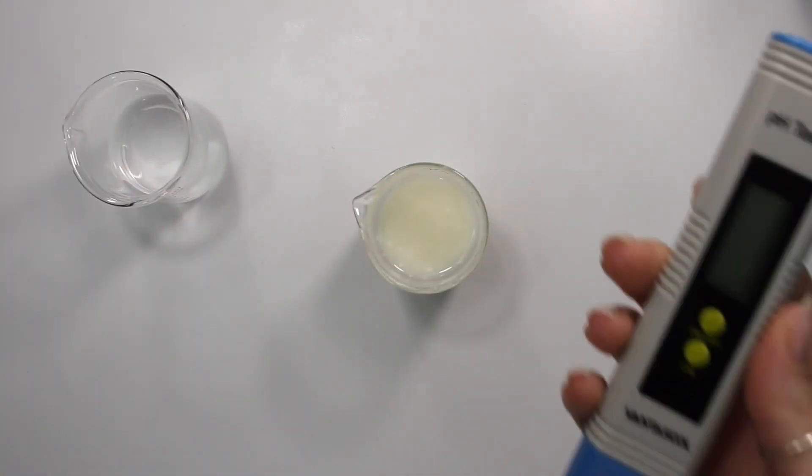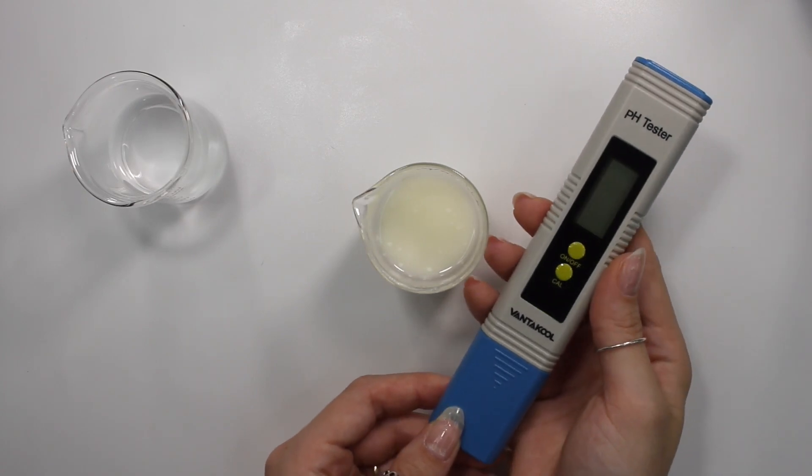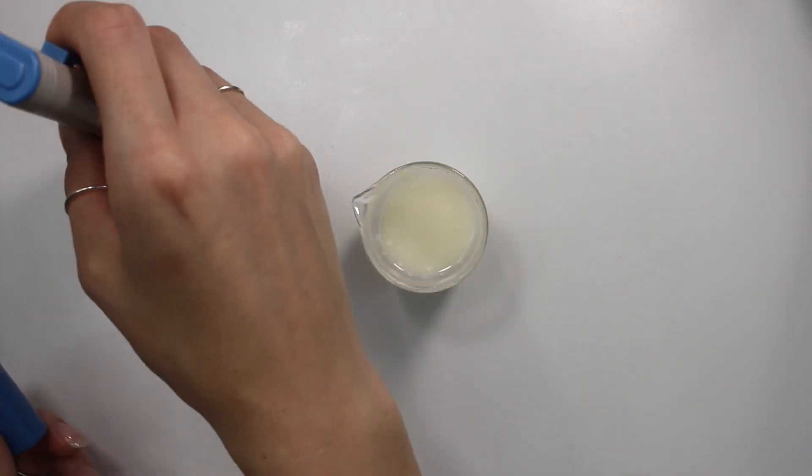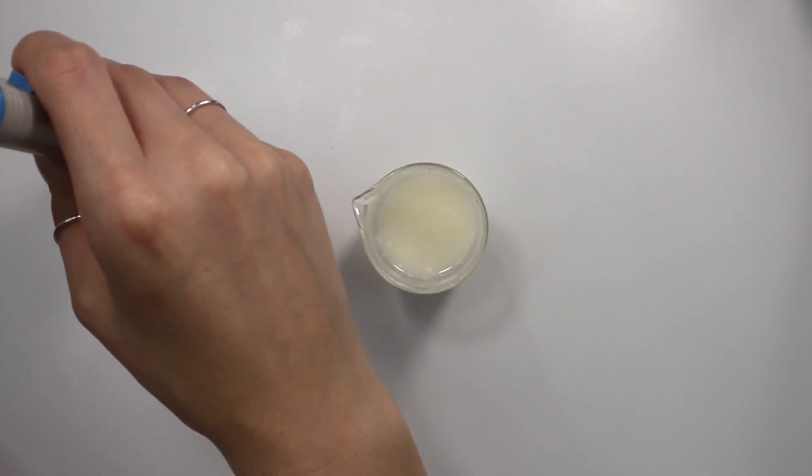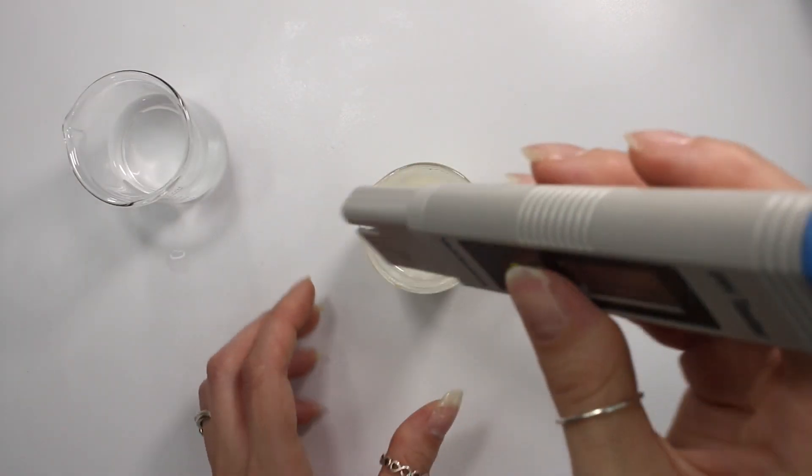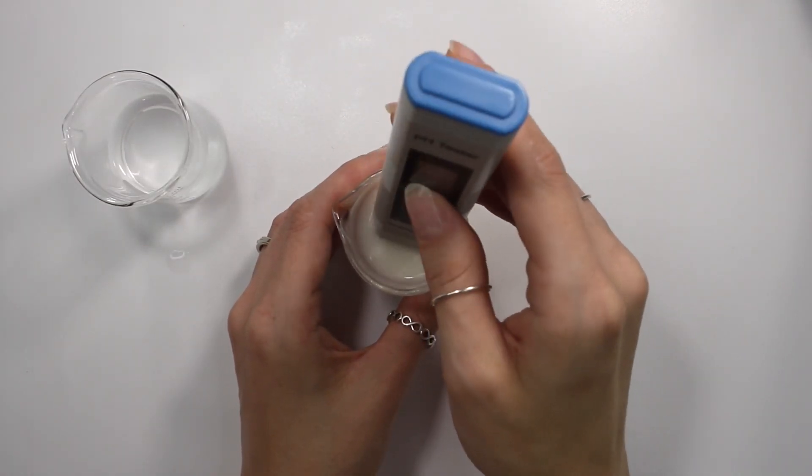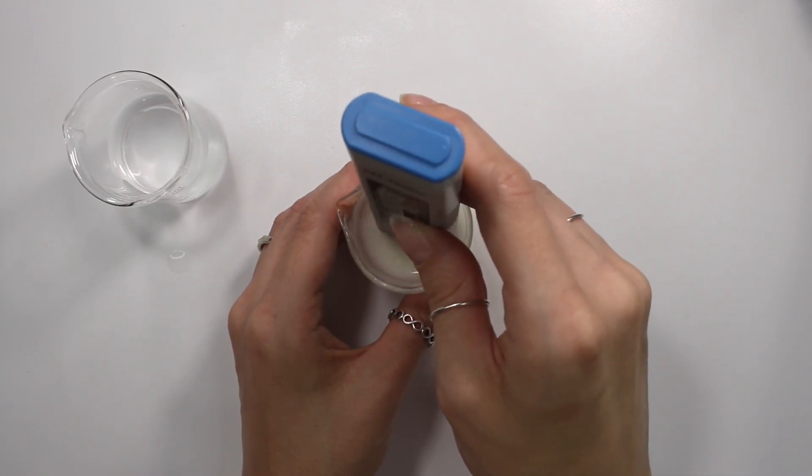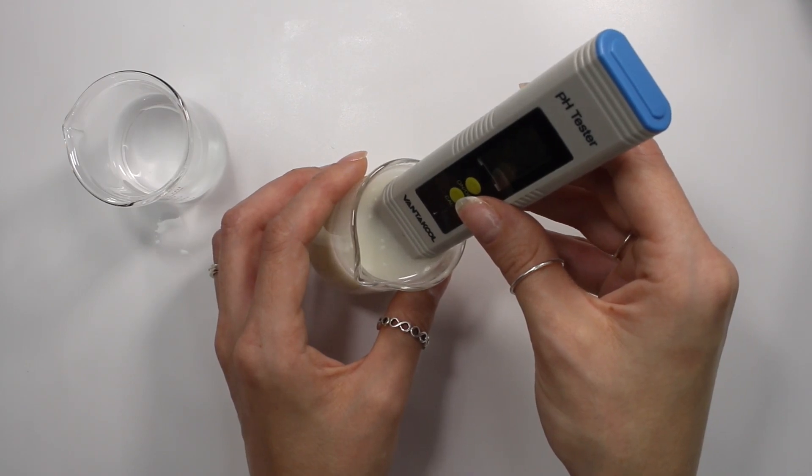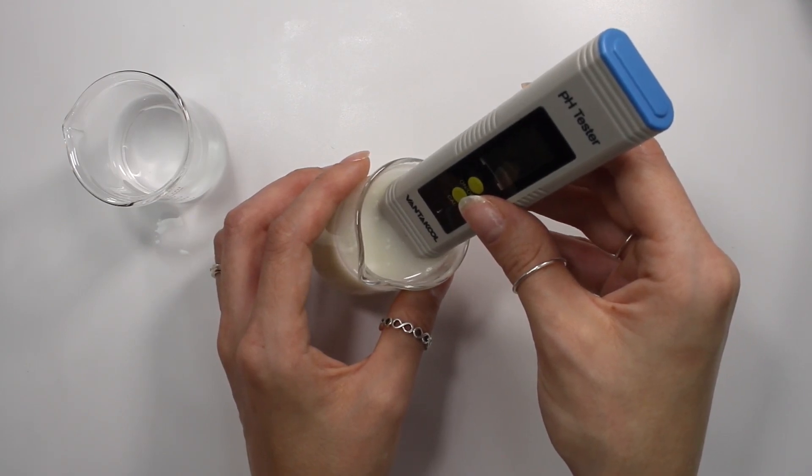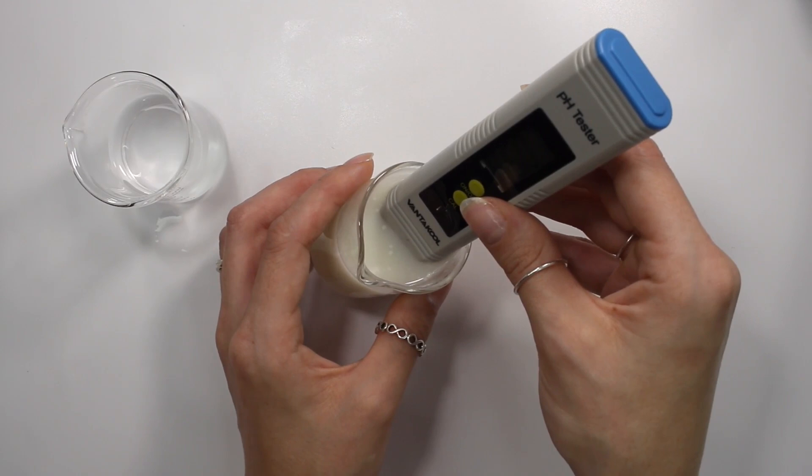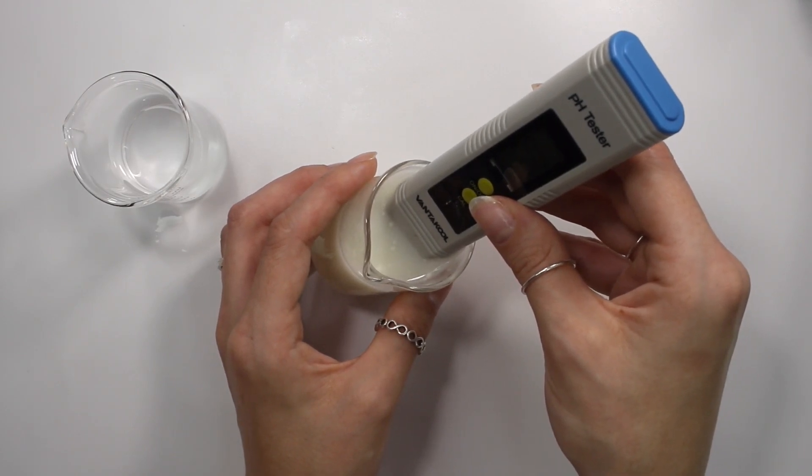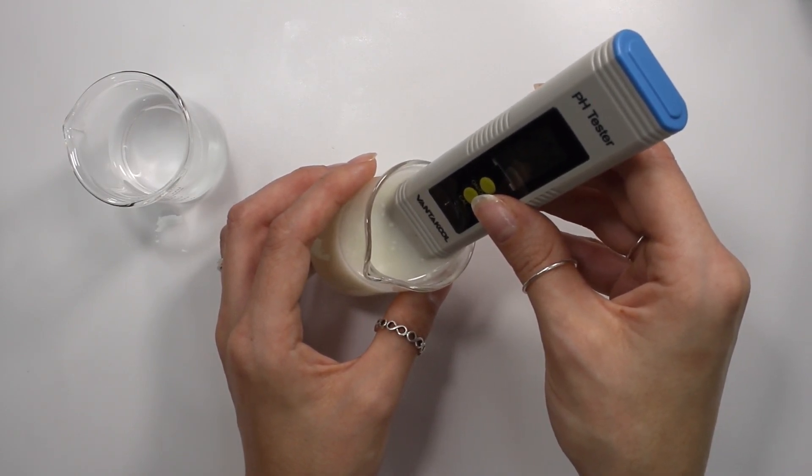And now I'm going to be using my cheaper pH meter to show you guys the pH of this one. So of course you want to rinse it in your distilled water first and then swish it around into your diluted cream solution for about a minute to make sure you get a stable pH reading. And this pH meter is reading a little different. I can't show it to you guys because I don't have a little hold button like the first pH meter does because this is cheaper.